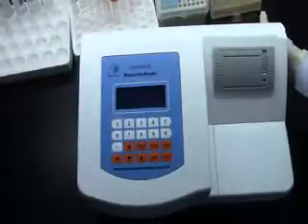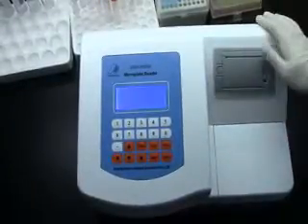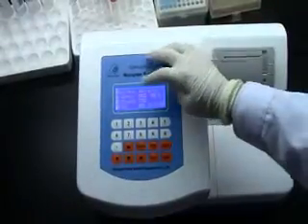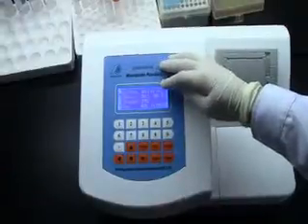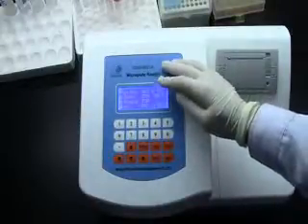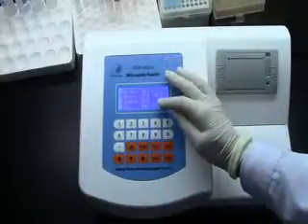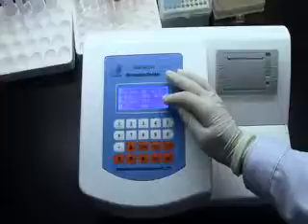Now let's power it on. The display shows: manual mode, date is January 15th, 2015. The washing values read 0.0, 0, and 06.3. The time is 11 o'clock, 55 minutes.